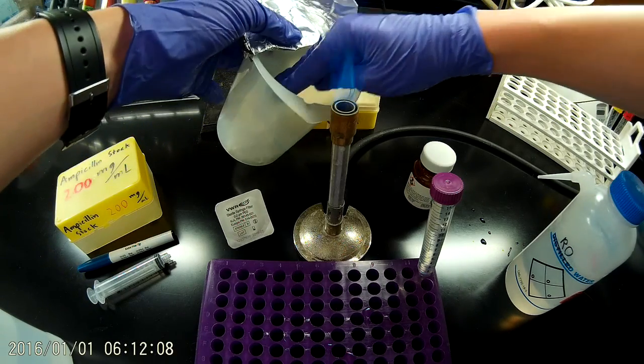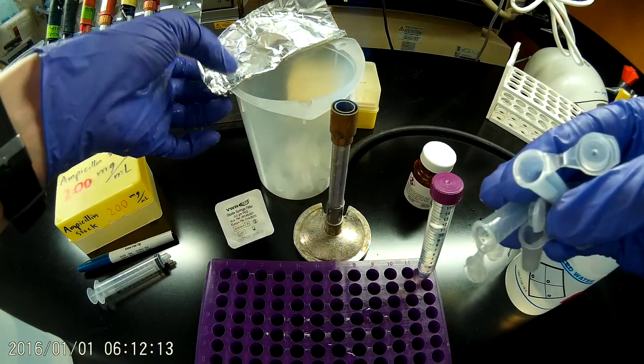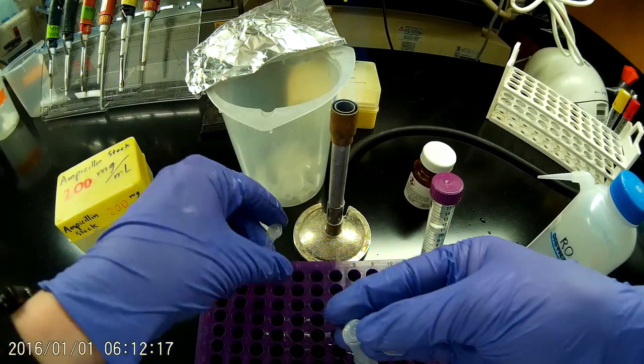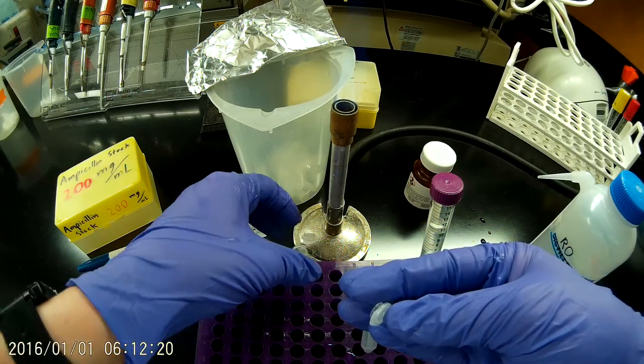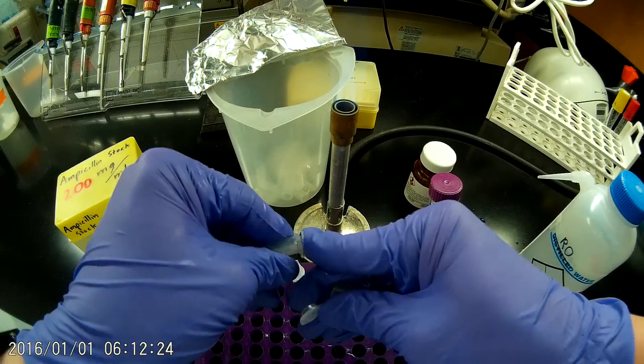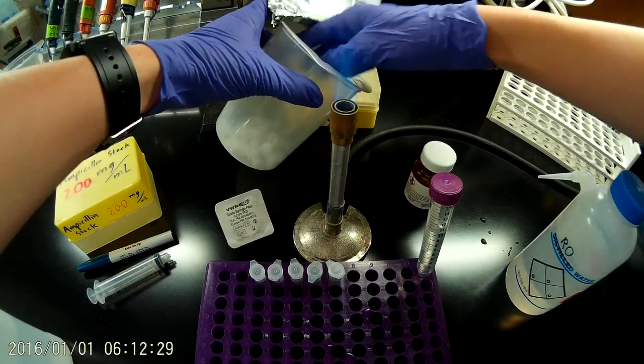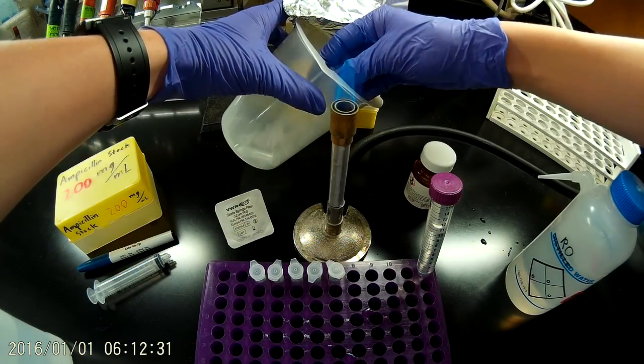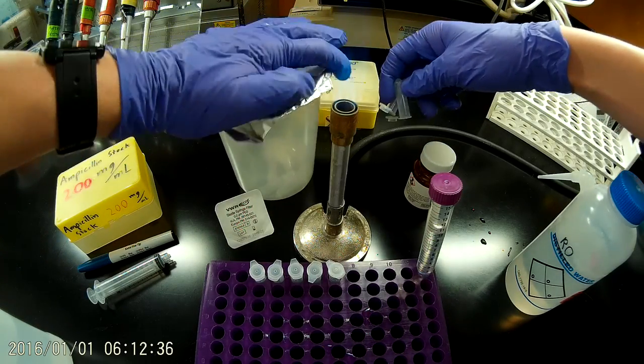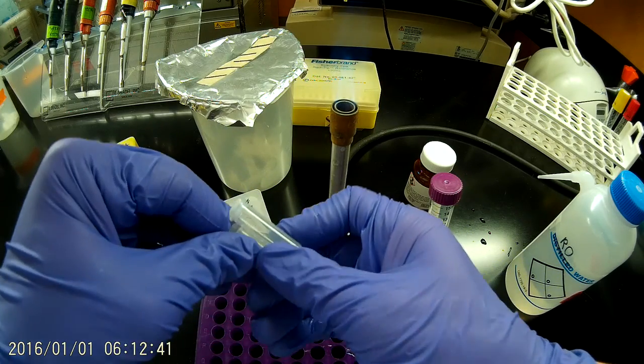I'm going to pull out some 2 mil tubes, these sterile 2 mil tubes. Keep that nice and close to the flame. That's 1, 2, 3, 4, 5. All right, I guess I need 2 more. And as soon as I've gotten those, I want to put the tin foil back on there so we don't get dust or any other sort of contaminants in our tubes.